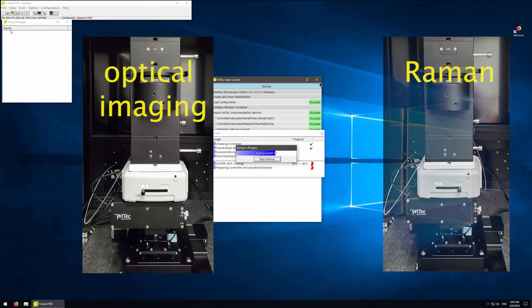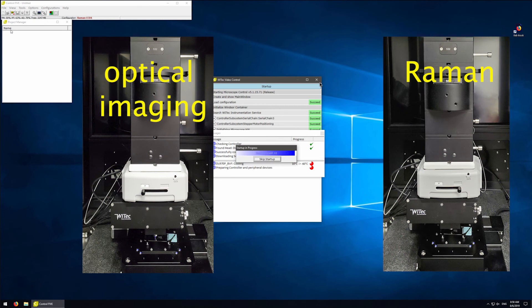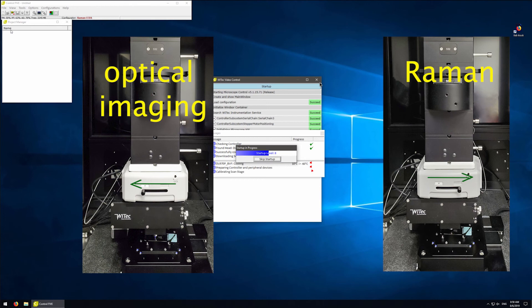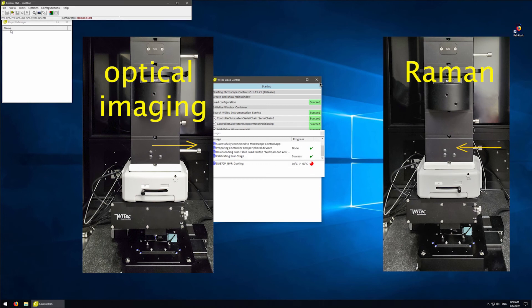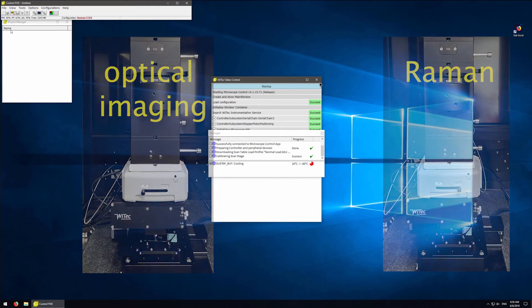Looking at the instrument, you will be moving mainly two parts: the swing arm to go from brightfield to Raman mode, and the pull to go from seeing the sample image on the camera to the Raman mode.